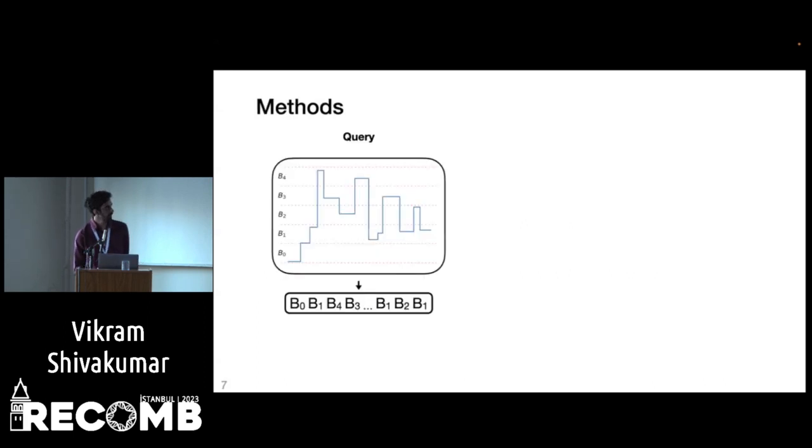And so just to get into the methods a little bit, here is an electrical current signal example, and we draw these arbitrary bin boundaries, where we're partitioning the picoamp space of the current, and we can assign a bin ID to each stretch of signal in the current.